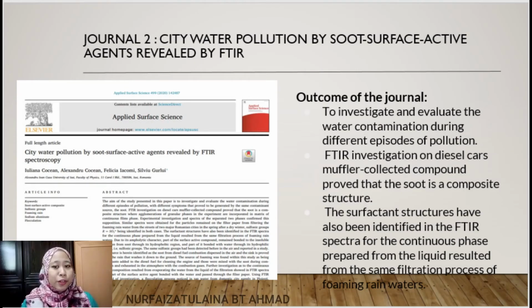So, let's proceed to the second journal, which is City Water Pollution by Soot Surface Active Agents Revealed by FTIR Spectroscopy. The outcome for this journal is to investigate and evaluate the water contamination during different episodes of pollution with different symptoms that prove to be generated by the same contaminant source, the soot.